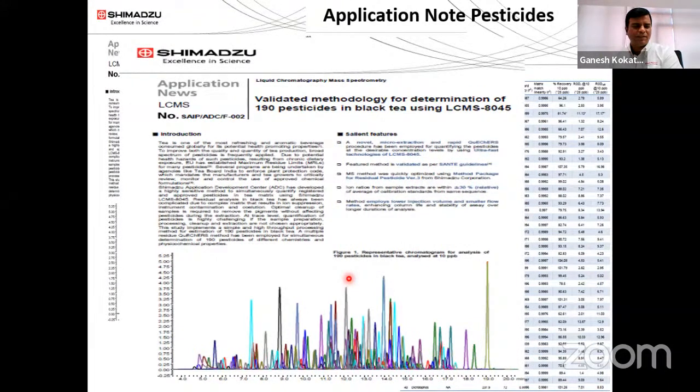In the pharma sector, mainly it is used to identify and elucidate structures, or to get a proper idea of nitrosamines, some carcinogenic compounds. Nowadays I think everybody is aware of the US FDA norms. So everybody is focusing on nitrosamine impurities, as they are highly carcinogenic, and on sartans. India is the biggest manufacturer of sartans and some diabetes drugs. So we are focusing on different nitrosamine NSA impurities, and we have a lot of applications on NSA with the help of LCMS.